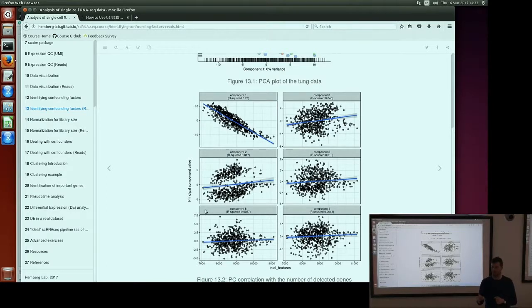So we sort of touched on that at the start. In that respect, when you look at the EXPRS matrix, the zeros in that matrix correspond to 0 counts, but the actual other values that we're getting are these log2 counts per million.